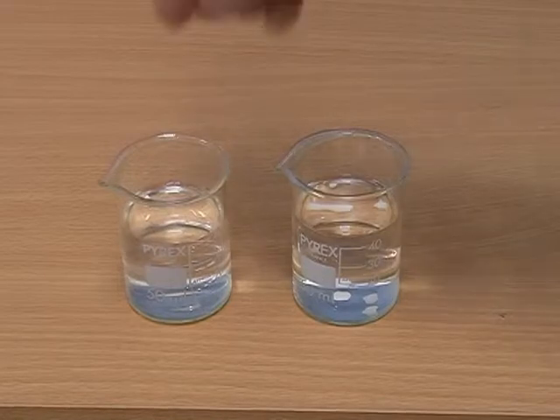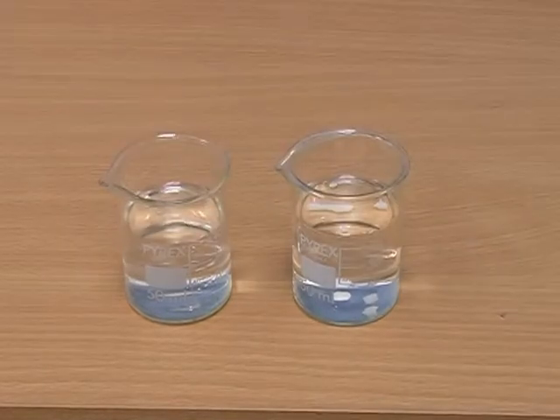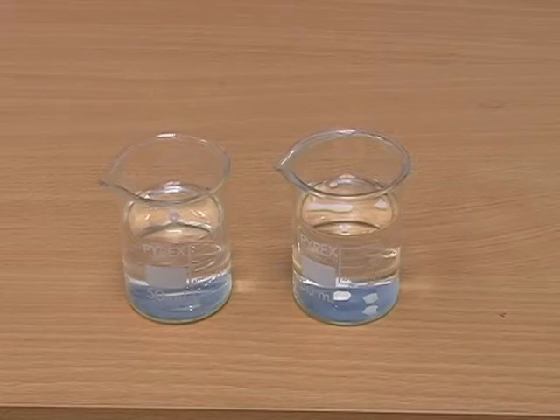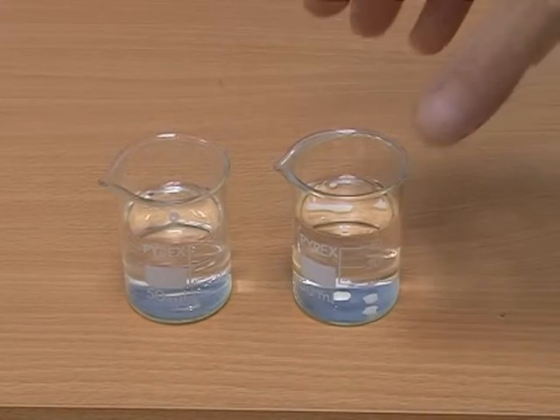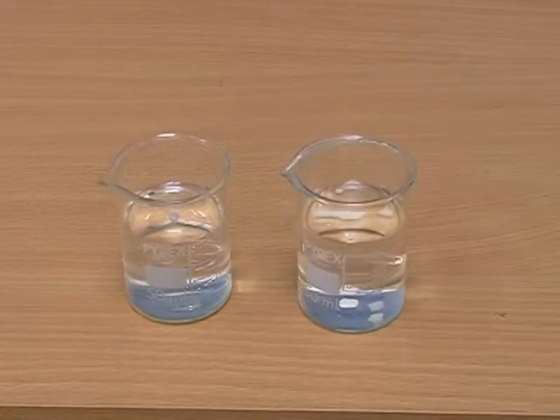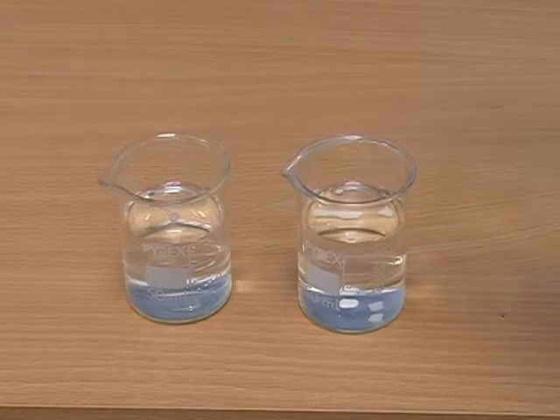If I place the same type of polymer into water, we can see that it floats. Because it floats, it means that the density of the polymer must be less than the density of water, which is about 1. So we know that the density of that polymer is somewhere between 0.8 and 1. Now, if we were to make different liquids — for example, replace alcohol with an alcohol and water mixture giving a density of, say, 0.9 — we could then determine whether the density of the polymer was greater or lower than 0.9.